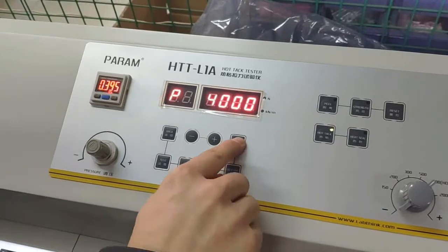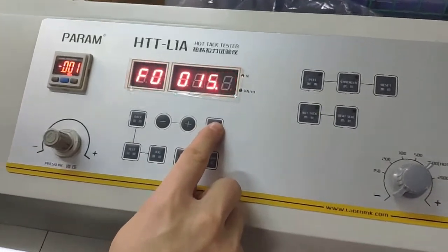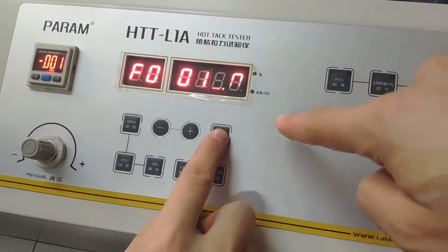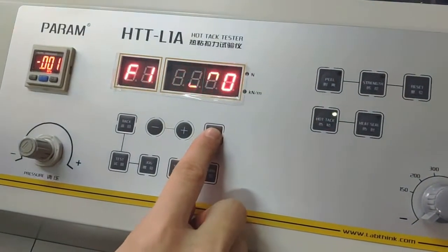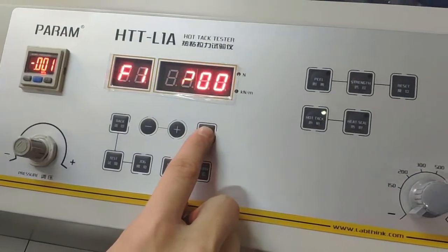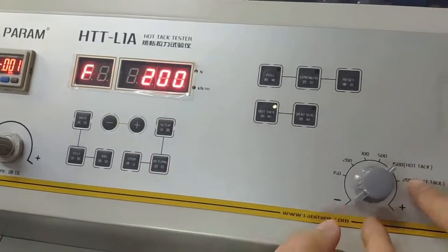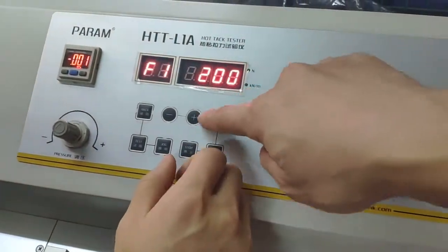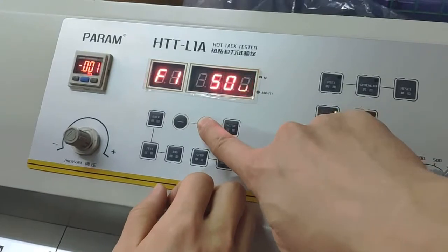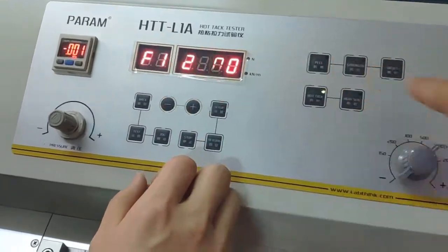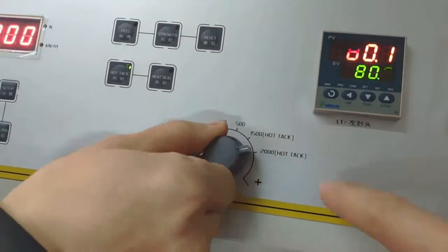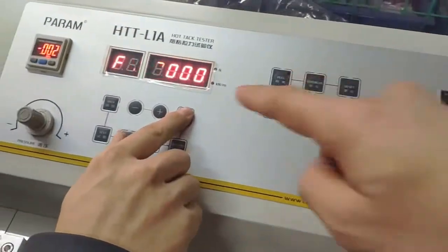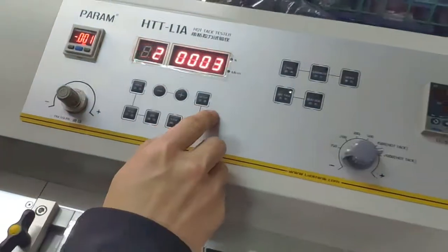After confirmed, you can go to the next one. F0 means the width of the sample, 50 millimeters. F1 means the speed. Actually if you do the hot tack, you have to adjust the speed to the right one according to the standard.